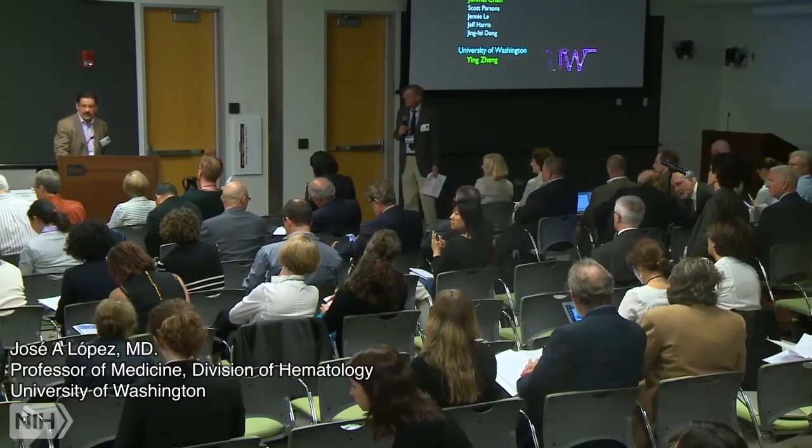The endothelial cells are more viable than they are in a planar culture. And we don't know how long you can culture them, but they seem to like to grow in circles rather than in flat planes. In terms of fibrin, that's a problem. We intentionally anticoagulate the blood, but we are now developing a system where we can induce a fibrin clot within the vessel, but we still don't know. We're very interested in studying contact activation of blood.